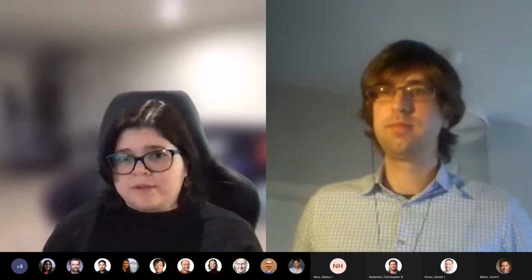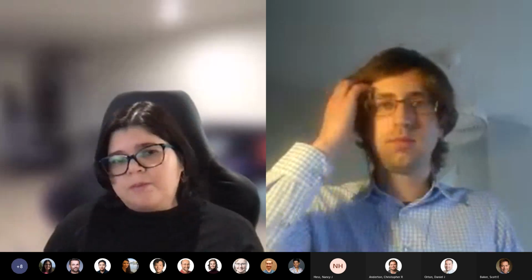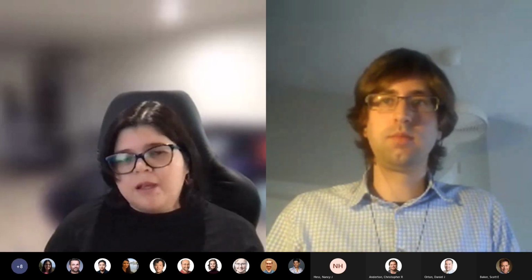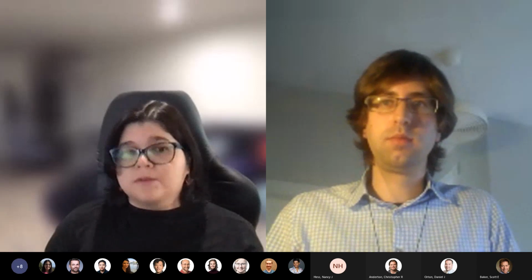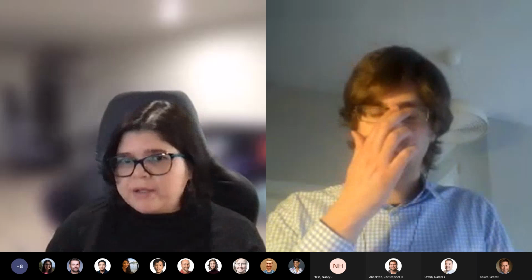It is my pleasure to host Hans Röst, currently an assistant professor at the University of Toronto in Canada. He is an expert developing computational methods for data-independent acquisition and mass spectrometry, among those the OpenSWATH software, which is now routinely used for proteomics experiments. Today, he will talk about his lab research working for now incorporating ion mobility to data-independent acquisition workflows. Hans, please.